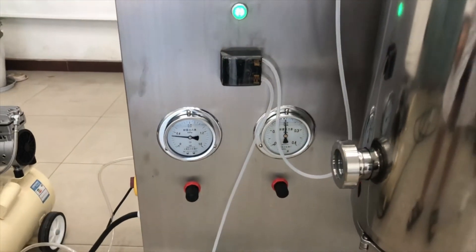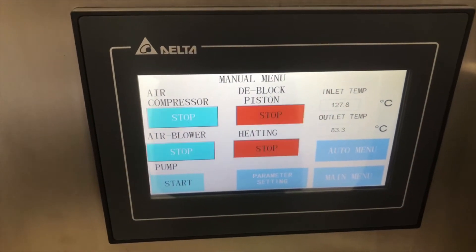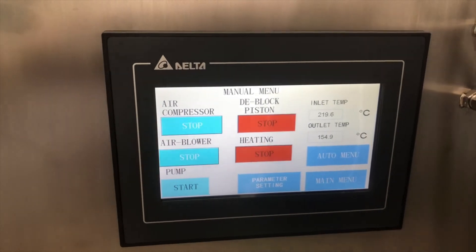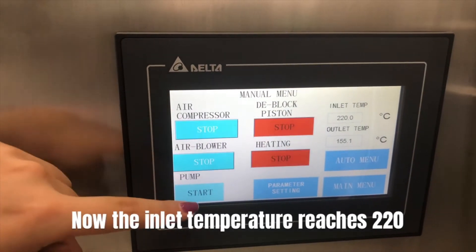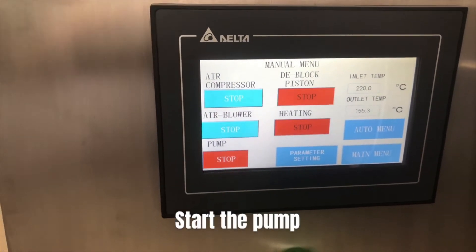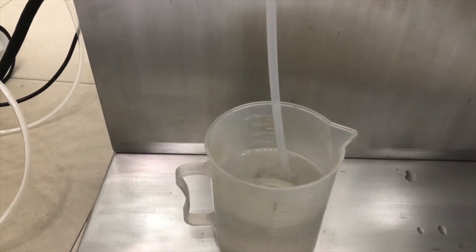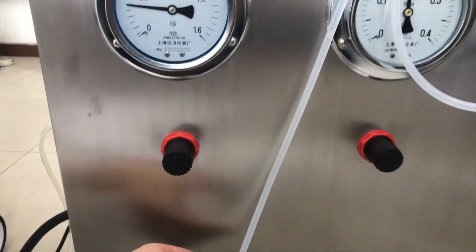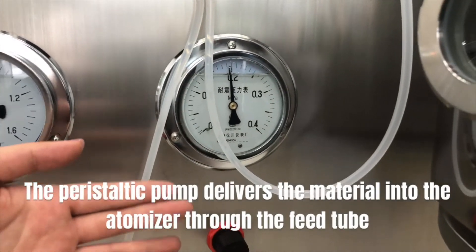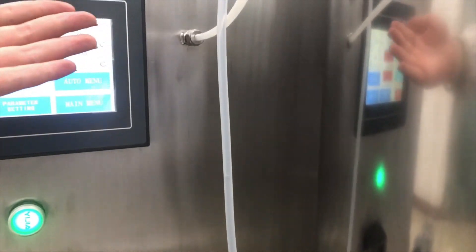Now the inlet temperature reaches 220. Start the pump. The peristaltic pump delivers the material into the atomizer through the feed tube.